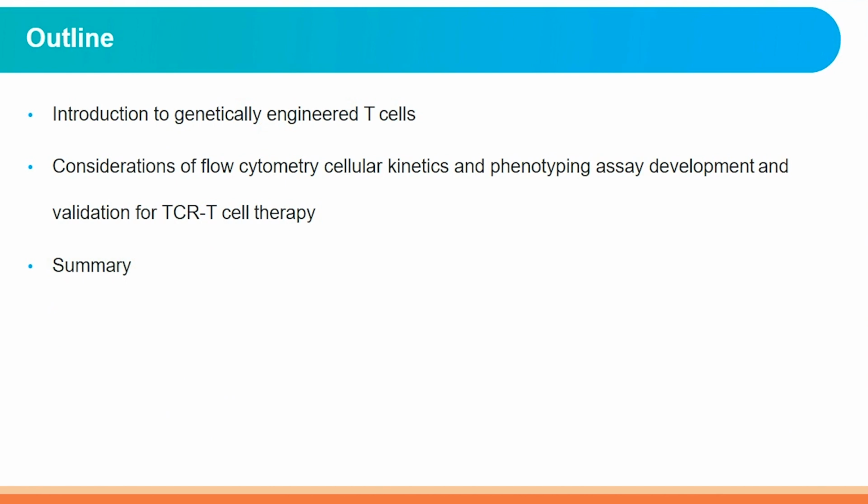This is the outline of my talk today. First, I will give a brief introduction about genetically engineered T cells, including CAR-T and TCR-T. And I also provide some background why cell persistency and memory phenotypes are important for cell therapy. Then I will discuss some key considerations in assay development and validation process, such as TCR staining and assay precision assessment.